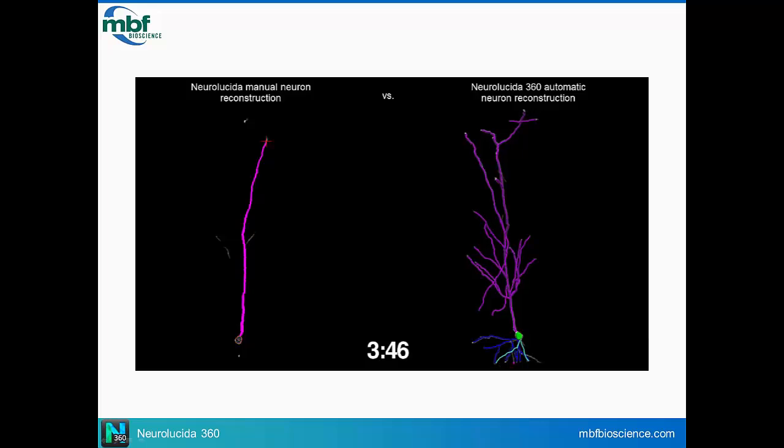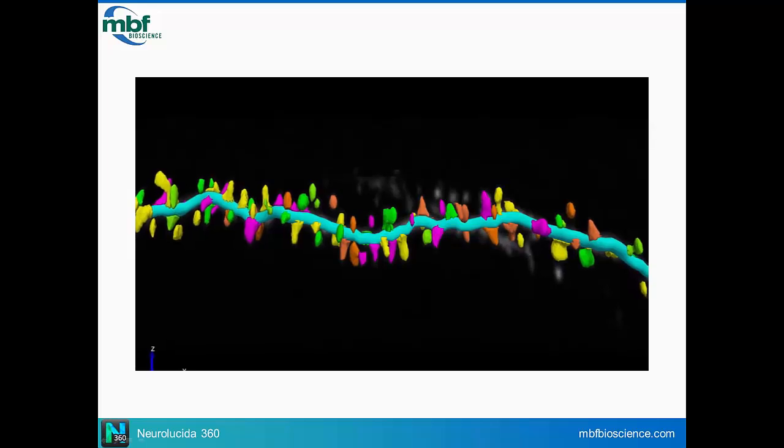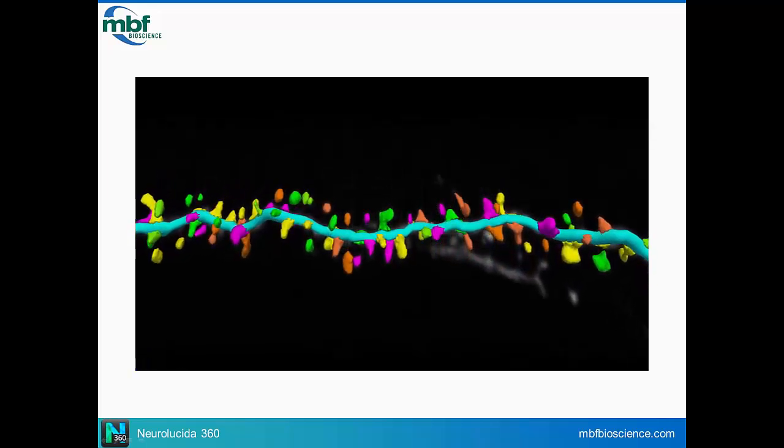And so that right there, I think, is a strong advantage for Neurolucida users, especially because we control so many different types of microscopes, everything from your bright field, simple non-motorized scope to confocals. So there's a lot of flexibility there.